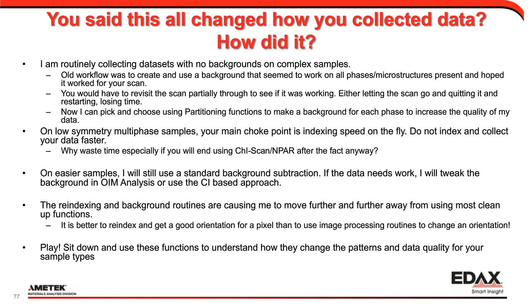On easier samples, I'll still use the standard background subtraction, because it does the job. If I need to, I can go back and tweak it, but if it's a good, easy sample, I don't need to.